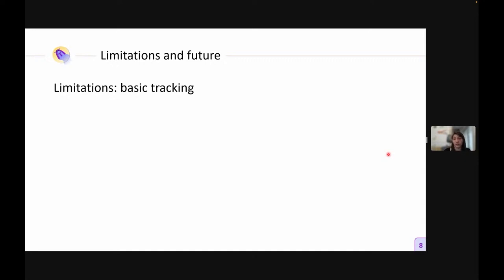There is absolutely nothing new in AnimalTA, but everything is put together. AnimalTA is a complete tool that I believe we were missing, allowing people to do very simple stuff. From a technical point of view there is nothing new, but it's just putting things together to make them accessible to the majority of people. But because of that, we don't have very complex tools, and we have a lot of limitations.